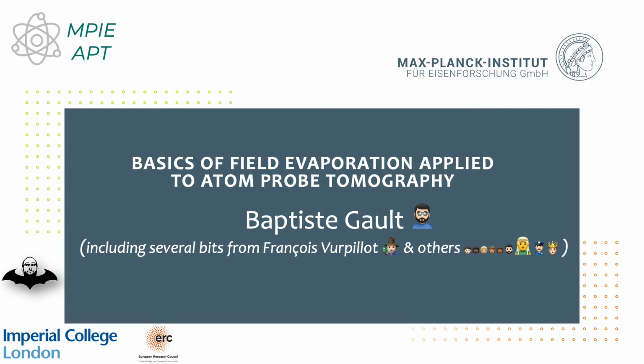Hi, and welcome to this brief lecture giving an overview of the field evaporation principles that are used in atom probe tomography. I'm recording this, and I took inspiration and several slides actually from different lectures given by various other colleagues, and especially from François Vurpillot.